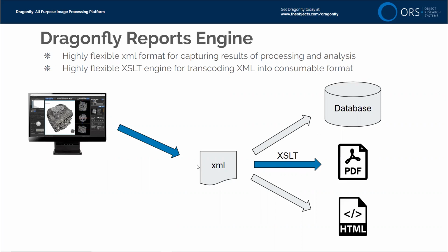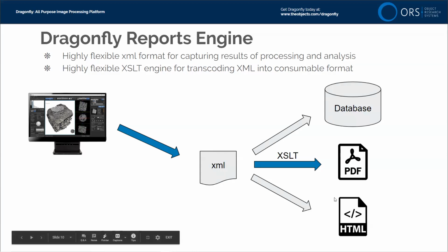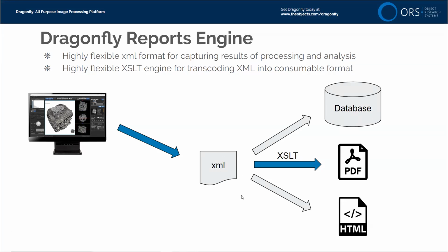Thank you, Matthew. So extensible style sheet language transforms. We are giving you the flexibility of creating a PDF. However, if you're working in some sort of enterprise environment where you need to extract all the information from all of your different studies and encode them in your database, you could write your own code that transcodes XMLs into your database. You could generate an HTML website that has all of your reports available as HTML pages. Anything is really possible if you want to write code to access XML.